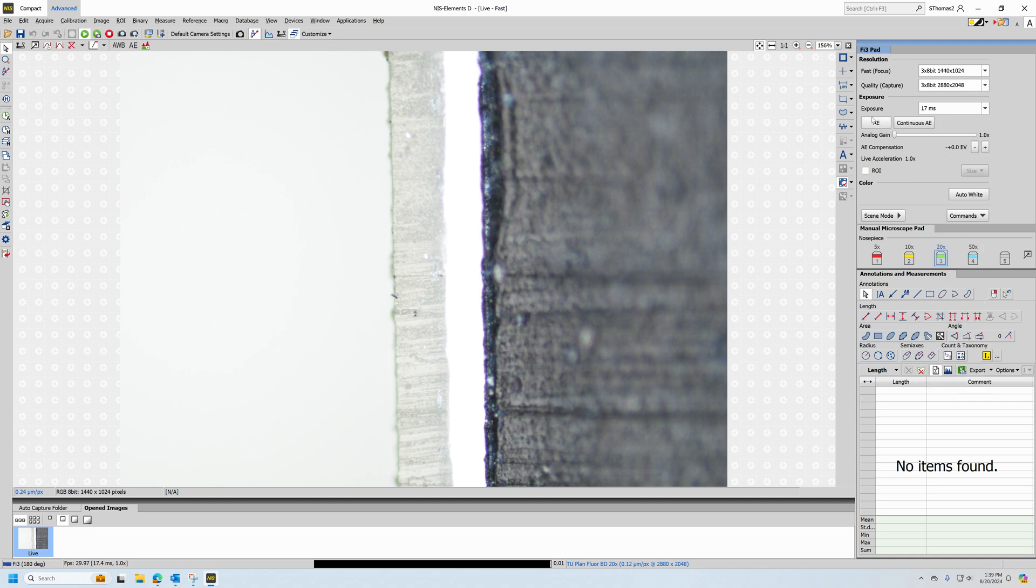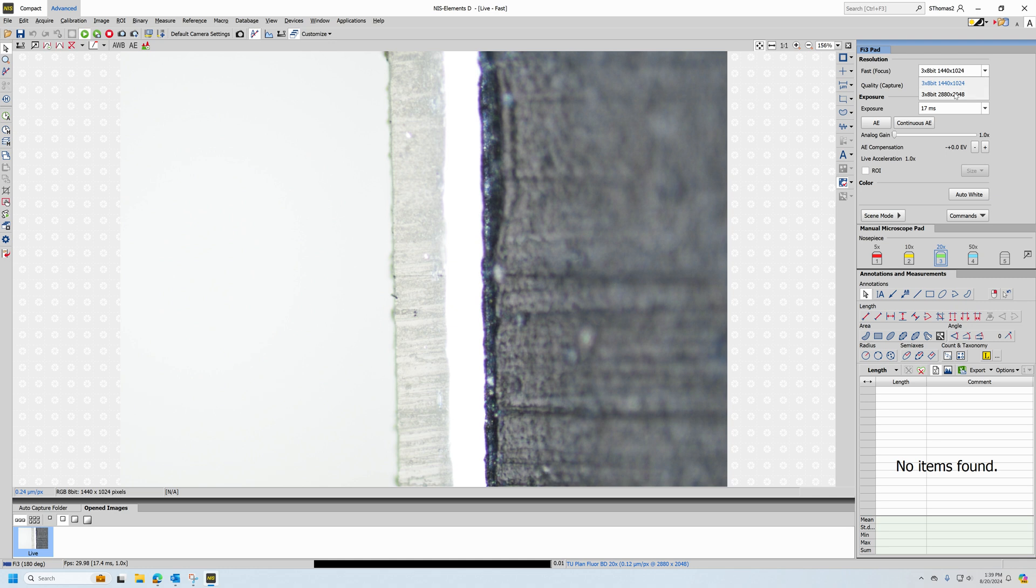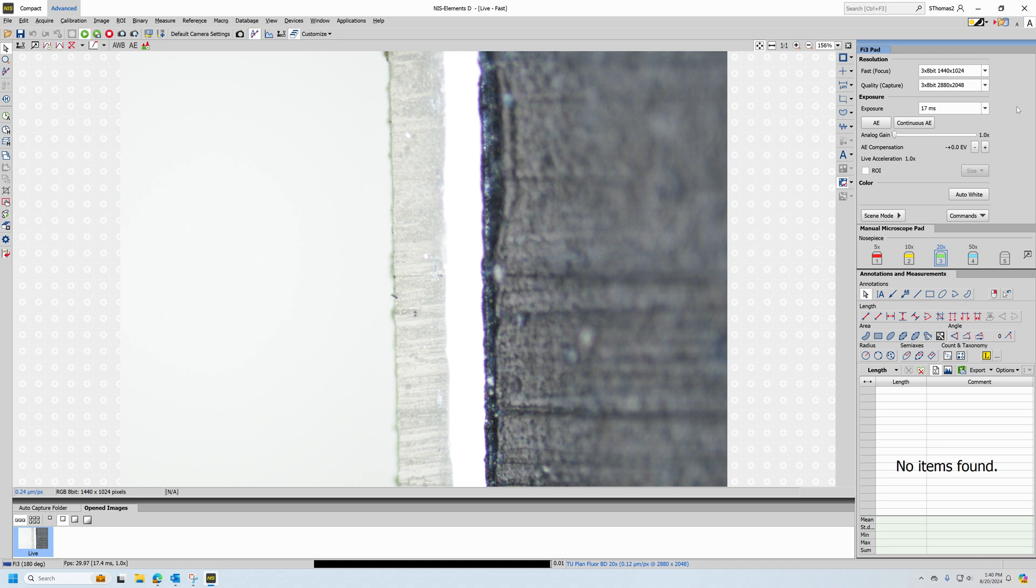You can do a full screen auto exposure. If the color needs to be adjusted, you can press the auto white button. If you need to change the resolution, you can pick either one of these resolutions. It's recommended to keep your live resolution, which is this fast focus section, at the lower resolution, but keep your capture resolution at the highest resolution.